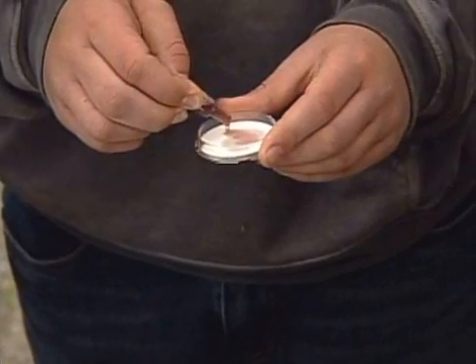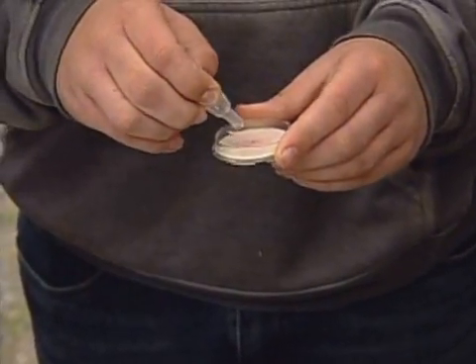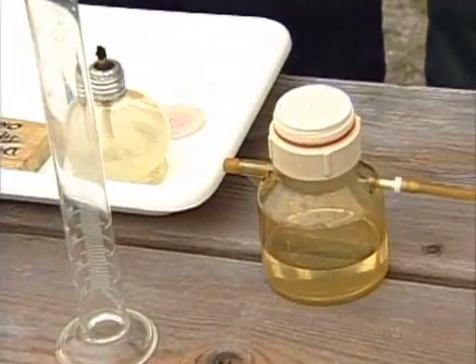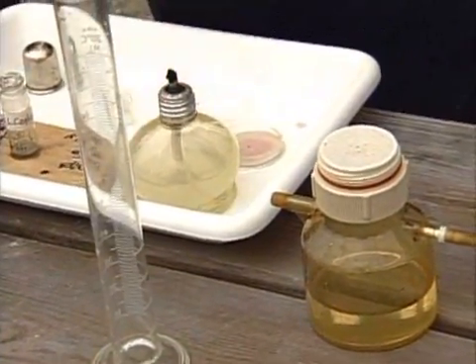This is kind of like a Denny's all-you-can-eat 24-hour banquet here. This is a lot of food. The fecal coliform are gonna love it. They're gonna eat it, grow in it, and hopefully we can get the paper onto this broth without contaminating it, because we want to do it in a sterile fashion. So how are we gonna do that, guys?